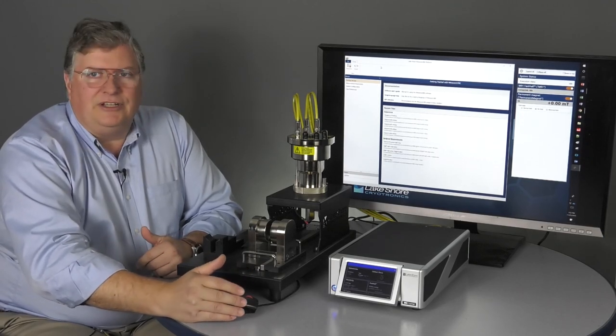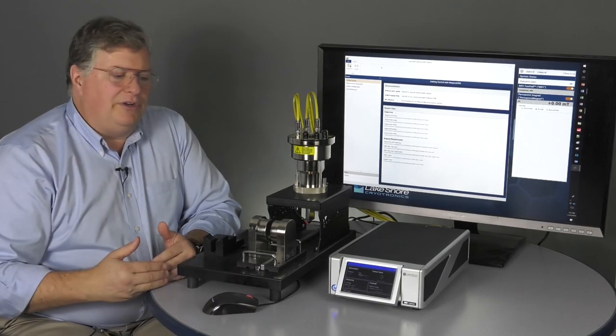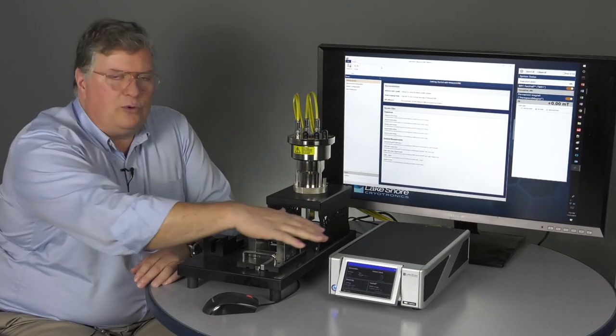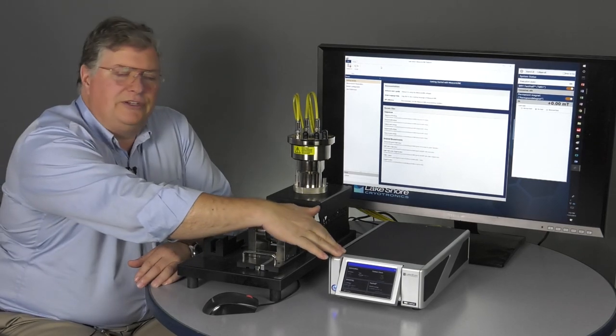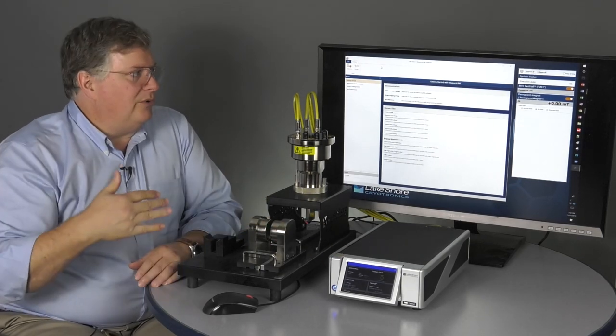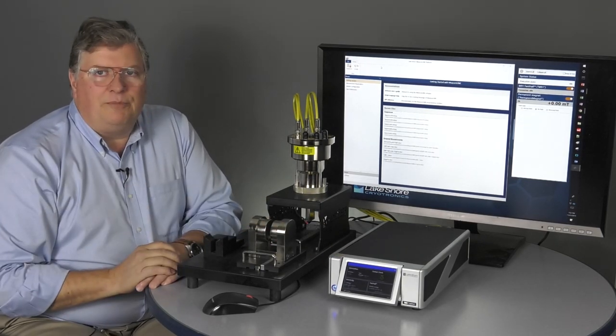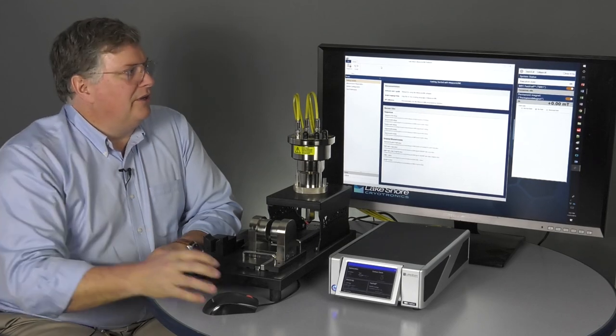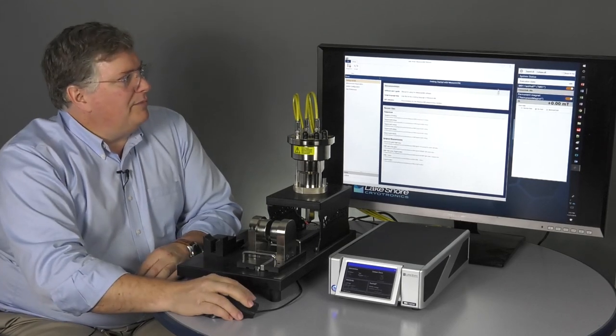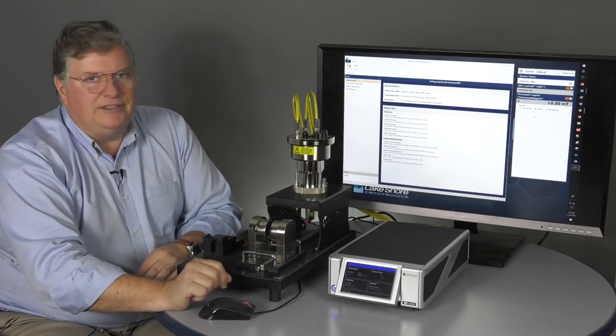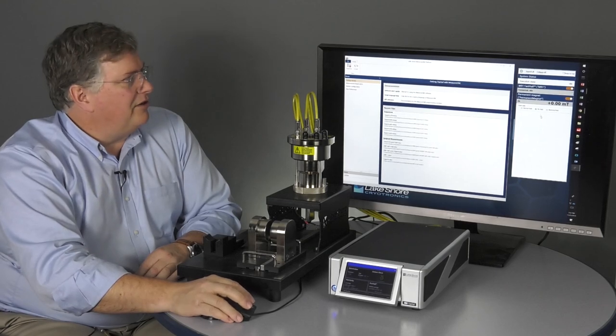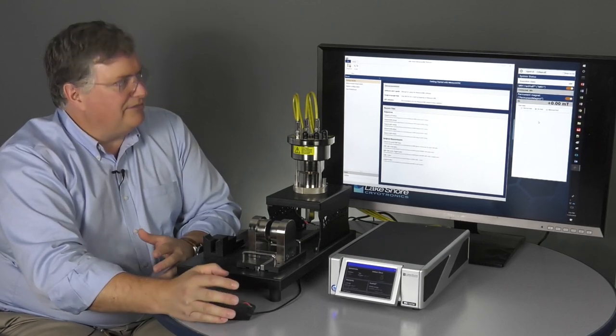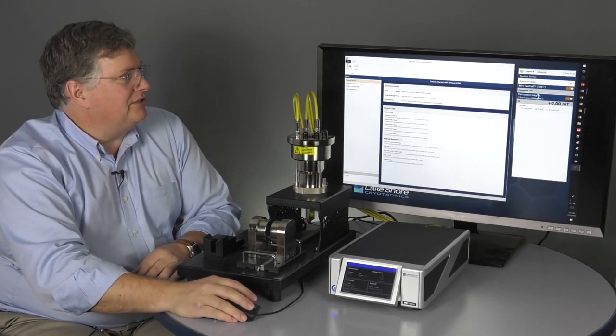The nice thing about MeasureLink is we've built it on a number of drivers for our own equipment, so for the Lakeshore M91, but also we can integrate third-party equipment with the universal driver. So, all of the equipment that we're using in the test can be listed in this monitor pane. We can change the configurations and have different configurations.